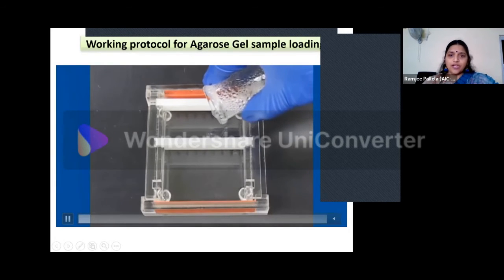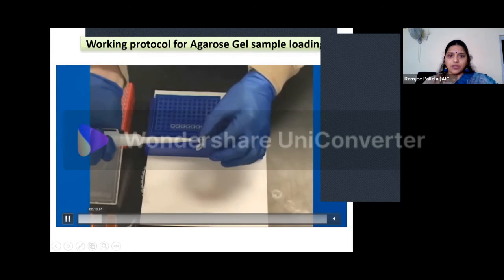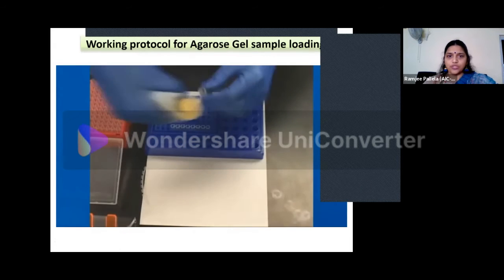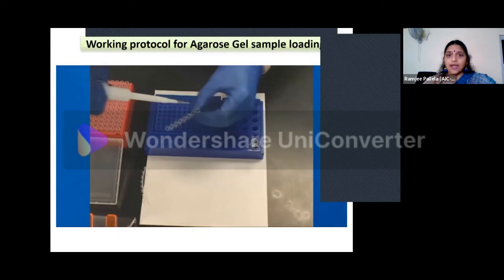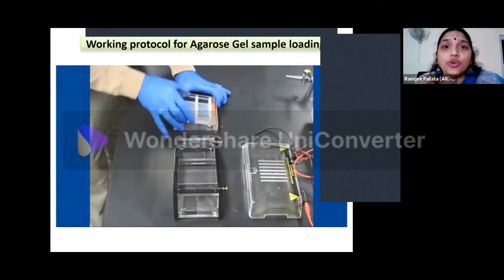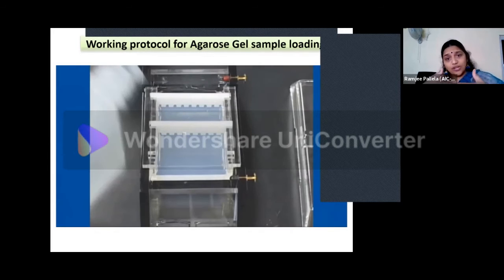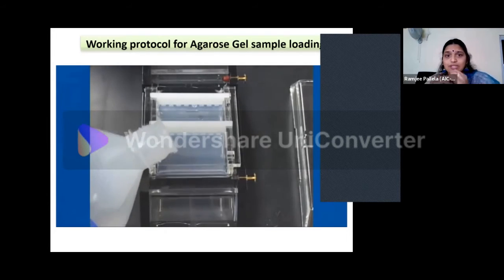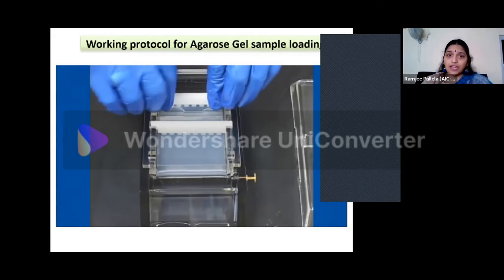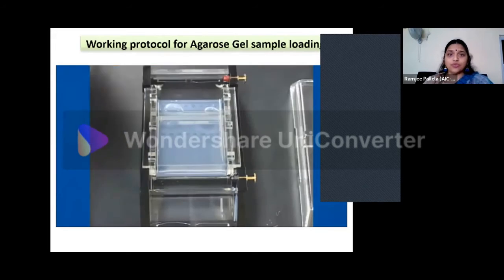So once you have poured it, then you have set it. Now you have removed it. Add your sample into the gel one by one, and before adding into the gel, you have to load it with the loading dye, because you need to know how much it has run. The loading front, the running front, you need to know. So for that, we put it in the loading dye, and then we add the running buffer, because electricity is to be conducted through that, right? So we have to use the buffer.